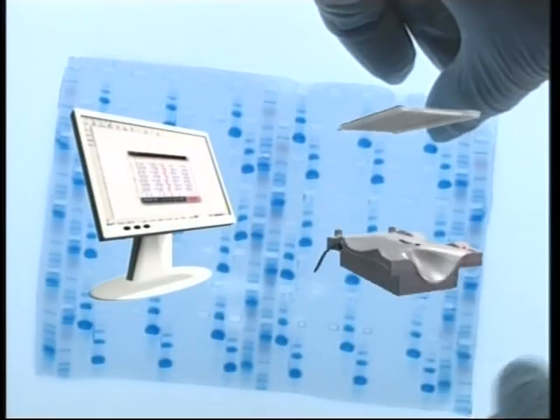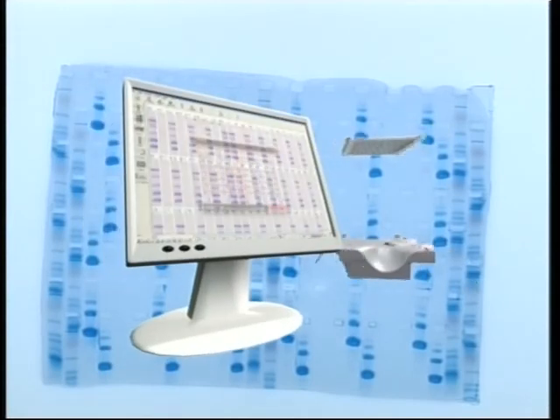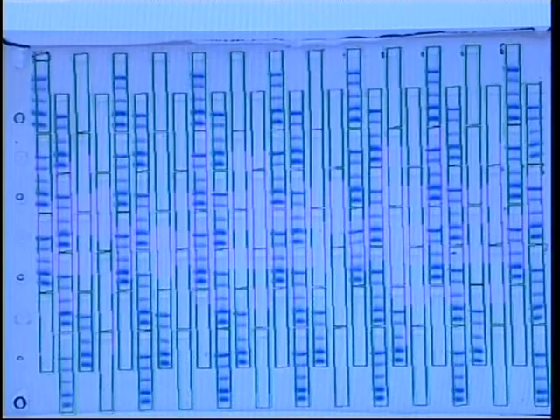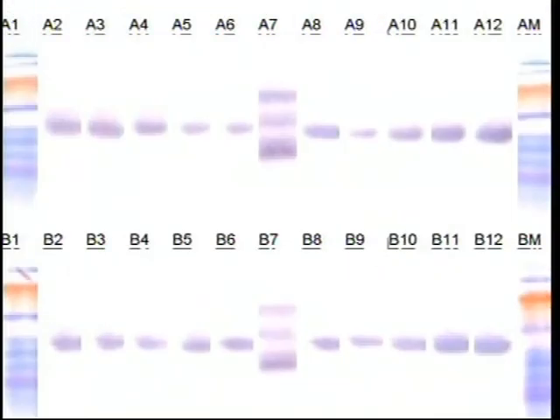The eEditor application is your tool to align the staggered lanes and manipulate the final image. Use it to compare, organize, and export your results. Studying and investigating proteins has never been easier.